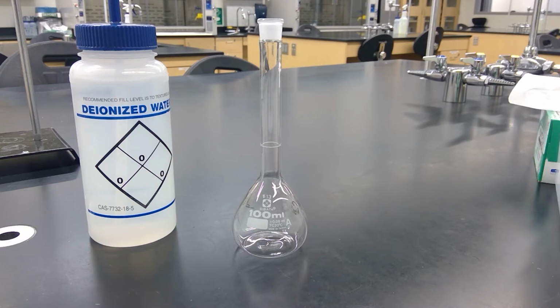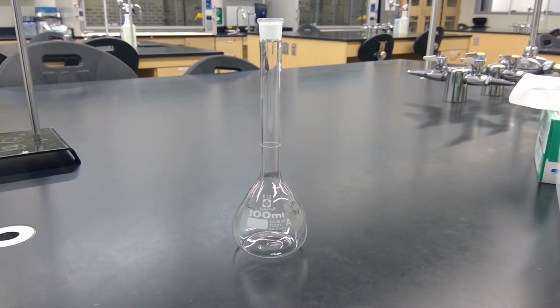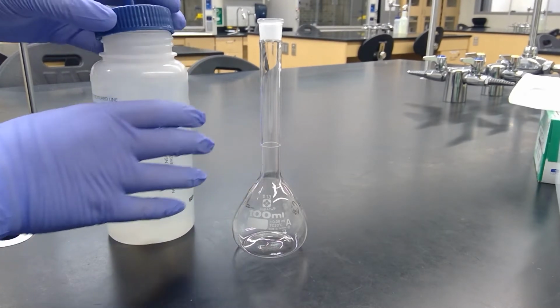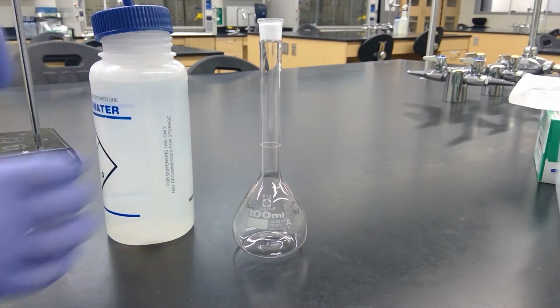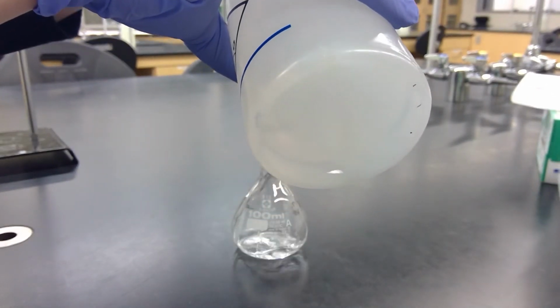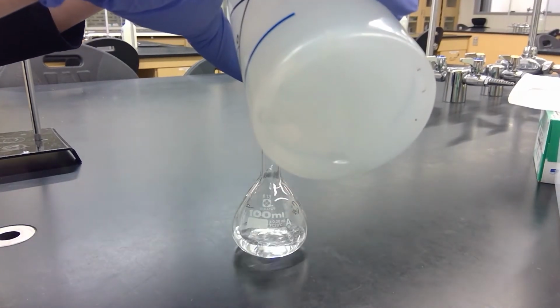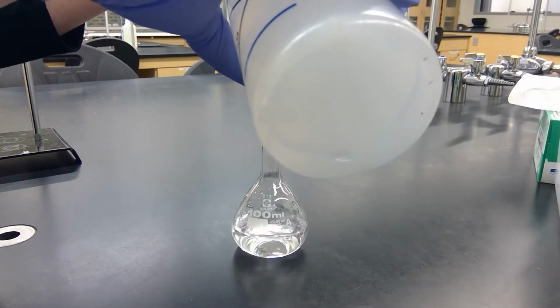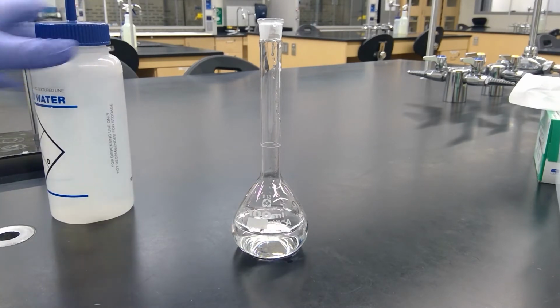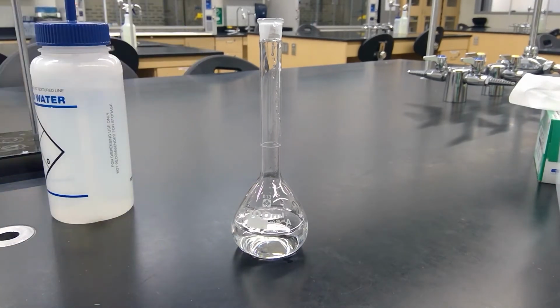We use deionized water. So what I do is I just open it up to pour. You'll want it about halfway full. So that's roughly halfway because the bottom is bigger than the top.